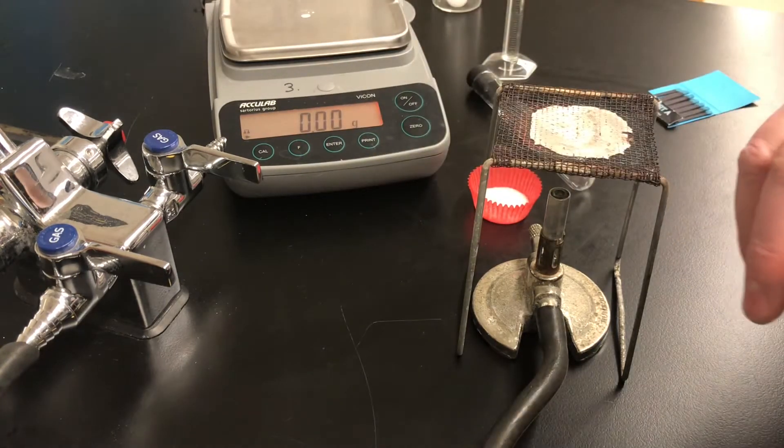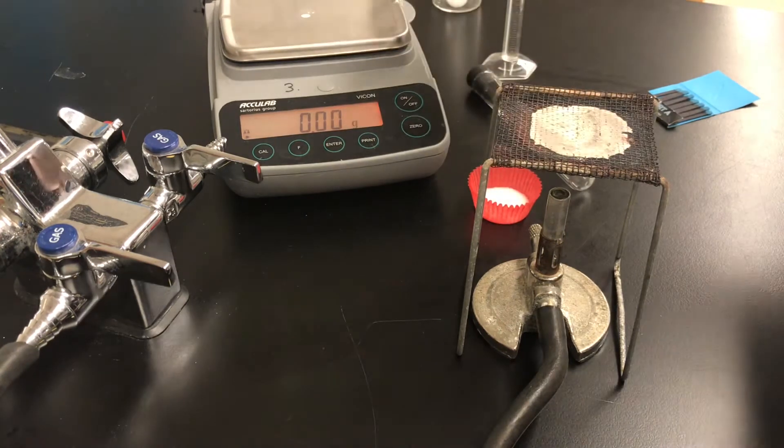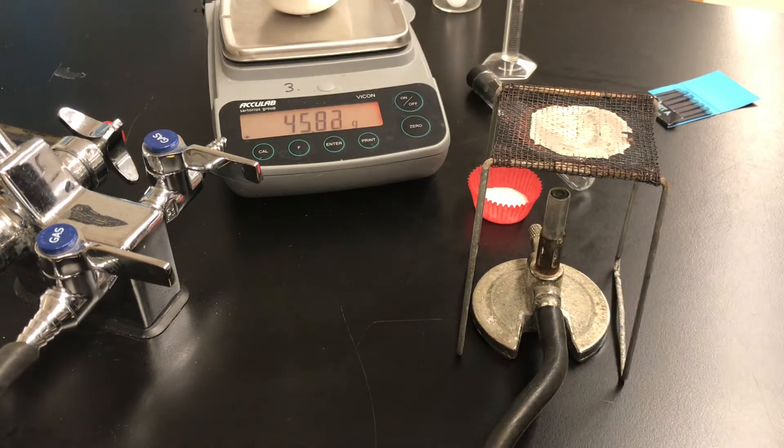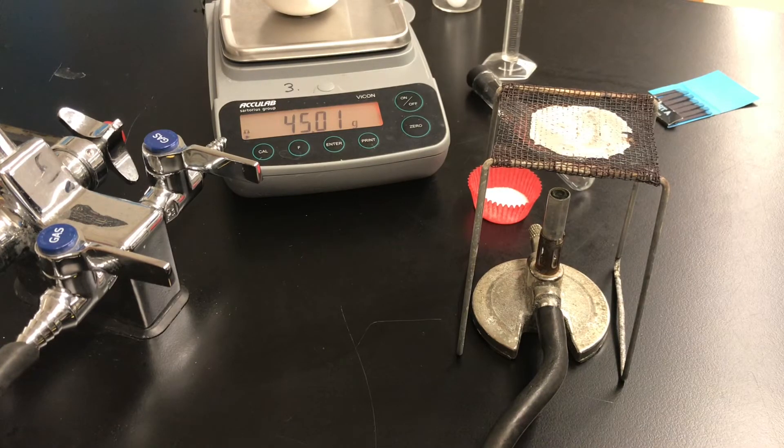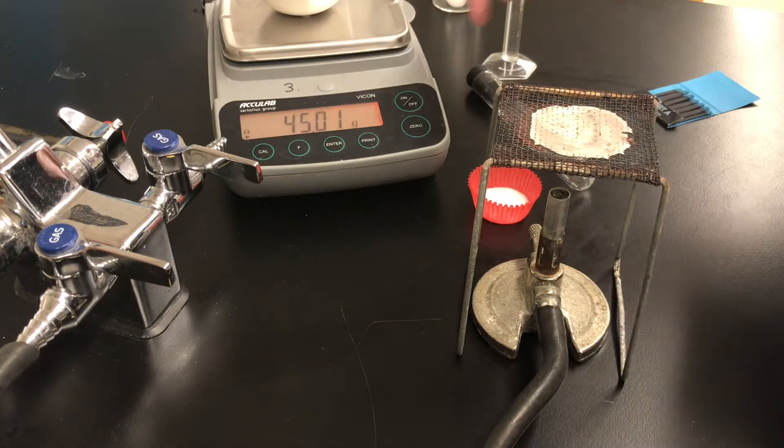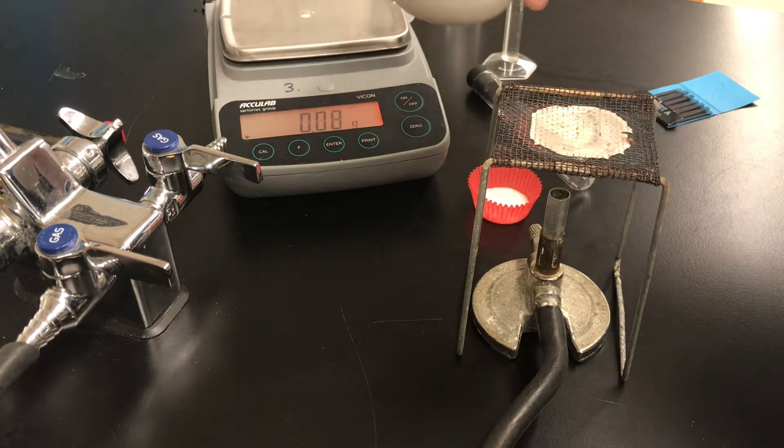Let's begin by recording the mass of our empty evaporating dish. If you have your own data table in your booklet you can record the mass of the empty evaporating dish, 45.01 grams. This is a centigram balance. The last two digits are decimals, so 45.01 grams.